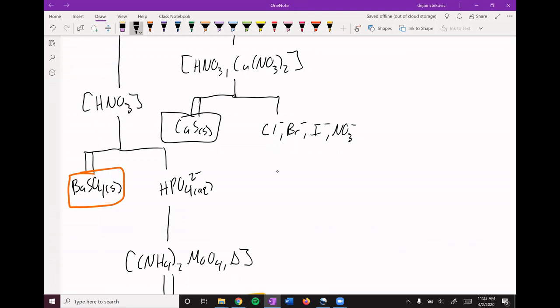All right, so we figured out the test for the sulfide. So now we're taking a look at the supernatant over here that has these 4 anions. So we're going to take a look at them one by one. We're going to start off with this iodide. And so let's see how we're going to test for that. We're going to add some iron nitrate and some toluene to this solution. So let's take a look at what each of these components should do.